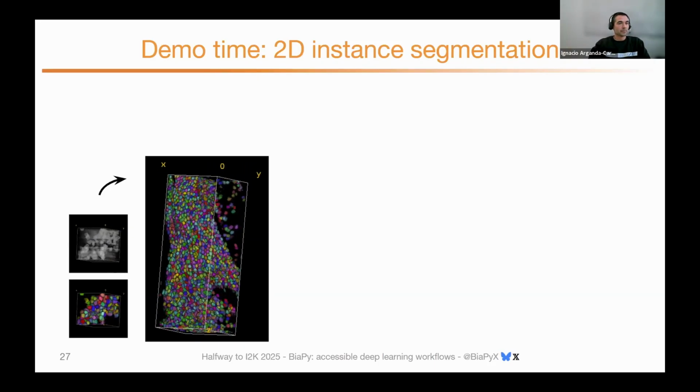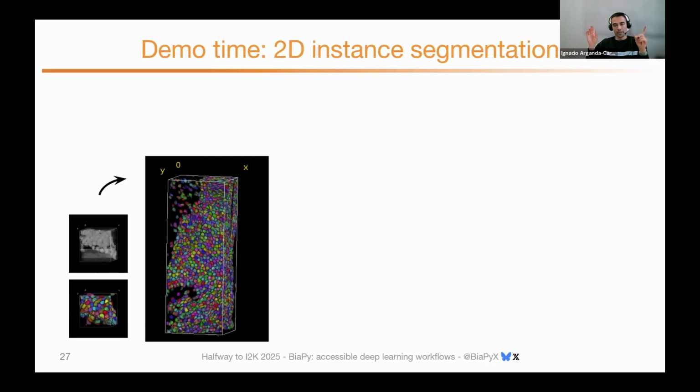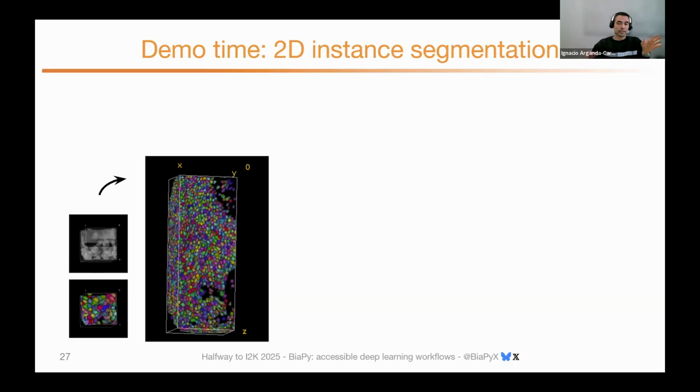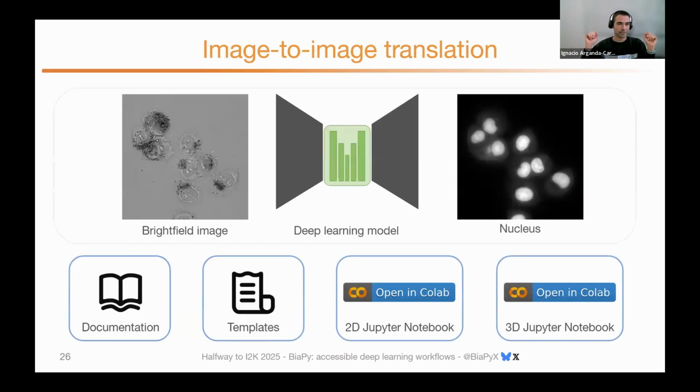Yeah. So this workflow was actually prepared for a challenge. The input images were like this, bright field images, actually with different zooms, and they were not always, how do you say this, out of focus. Focused, yes, that's it. They were not always focused in the same places, and then we had multiple channels with different organelles. And that was the task for the challenge.